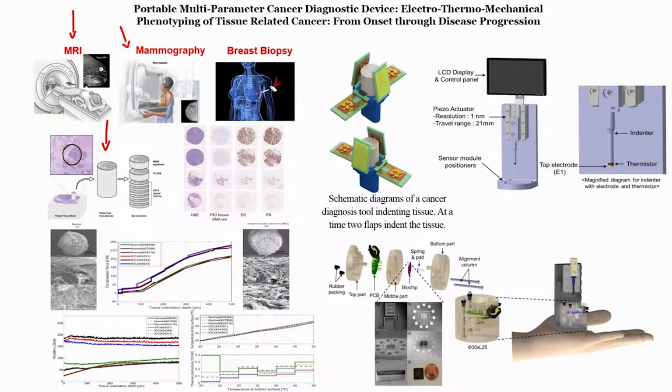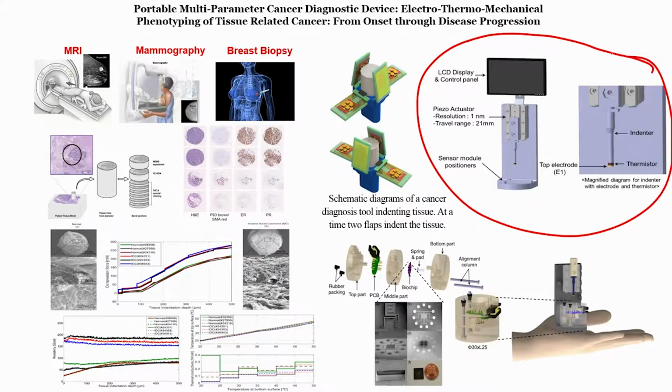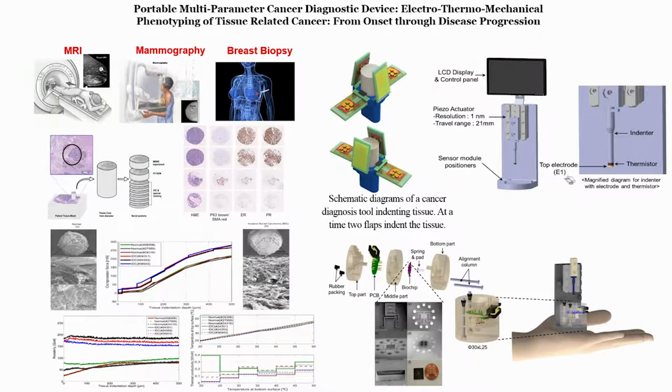Now what we are planning is, can we measure the electrical, mechanical and thermal properties of this tissue, and for that what we can do. So now you take this particular example. This is very important, and then we will see how we can fabricate this particular tissue chip, and place it for understanding the tissue property.